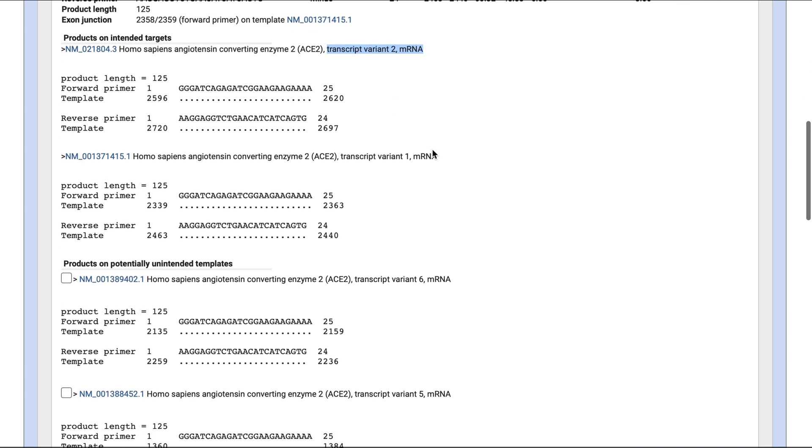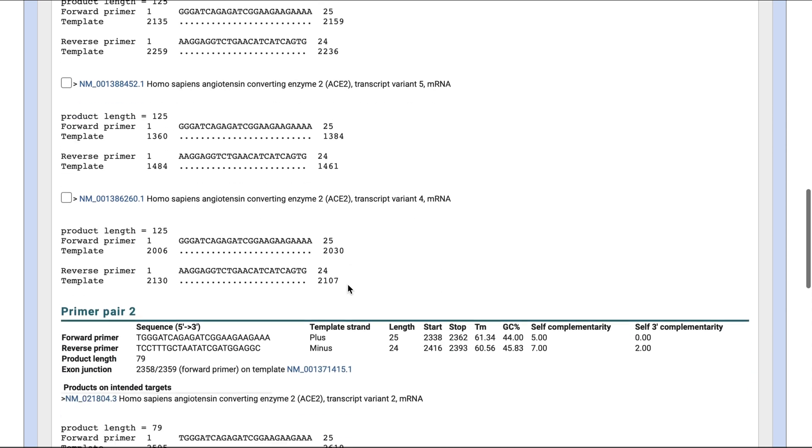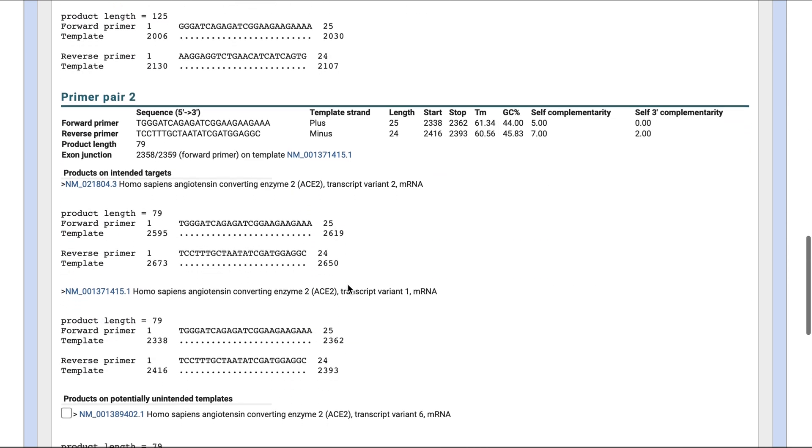If they were complementary to other genes, then you want to avoid picking those primers. If you continue to scroll down, you'll find the other primer pairs returned by the program. Take a look at the options, pick the best two to three primers, order them, and test them out.